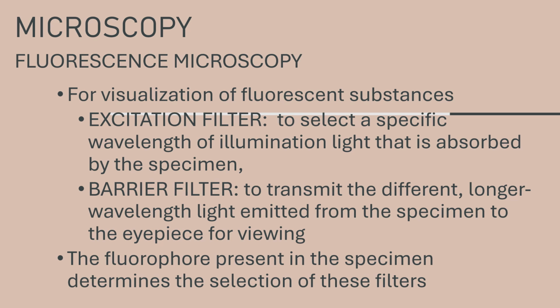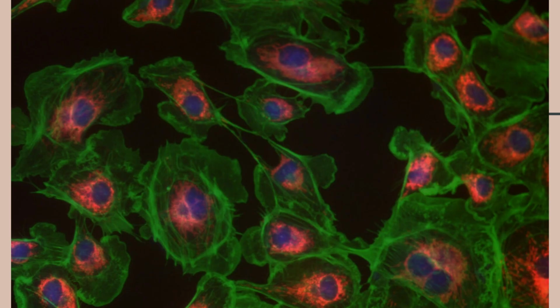This one is the same principle as in your chemistry. The fluorophore that is present in the sample, whether natural or added, determines the selection of the filters. This one is an image captured from a fluorescent microscope.